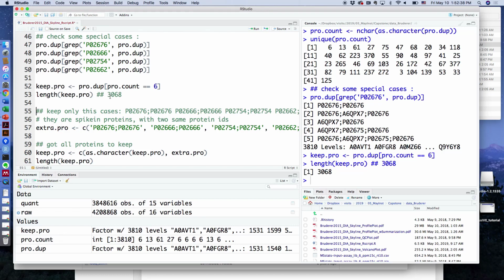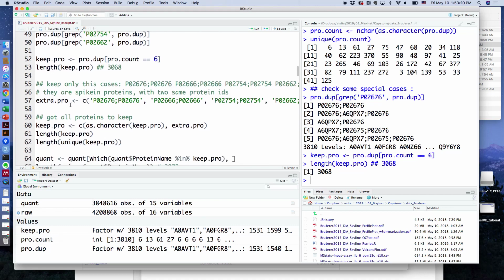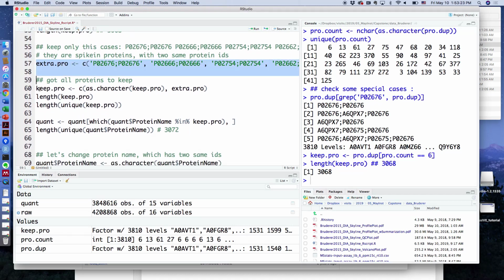At this moment, yes. Because I know this specific experiment very well. I said this is a spiking data set, so I know very specific proteins should be changed or not. Around 800 protein IDs, actually not unique protein IDs but combinations of some proteins, can be affected when you calculate the adjusted p-value and so on. So I just want a more conservative way and keep the proteins which are not sharing the peptide. This is the whole step of what I did.